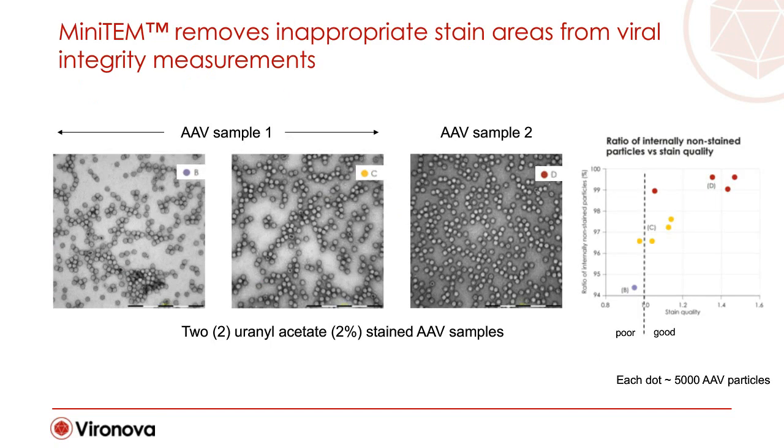So going back to this slide, a proper embedding of a virus particle. The embedding that is used, with a heavy metal salt in negative stain, is for two purposes. One of the purposes is to get contrast, because we have a carbon surface, and viral particles are made more or less of carbon. So it's carbon on carbon, and we wouldn't have so much contrast.